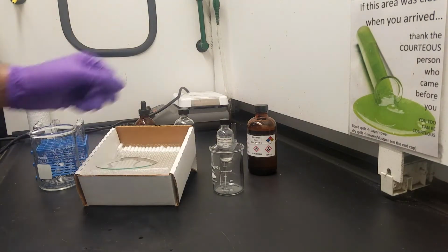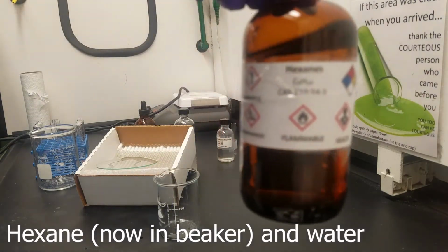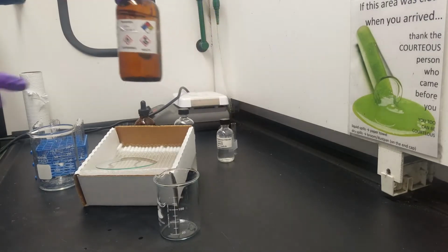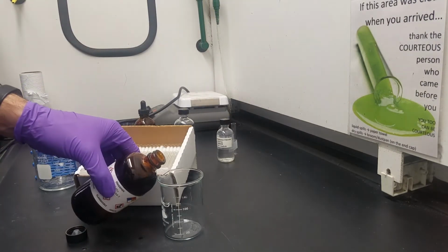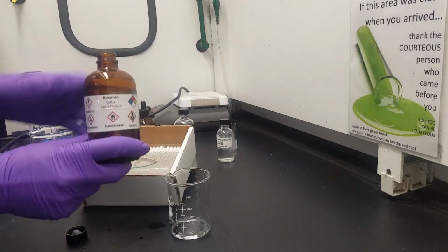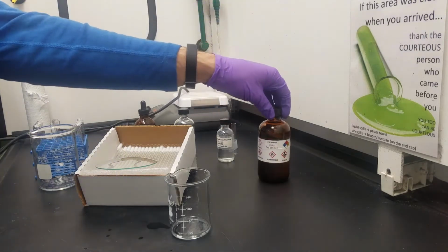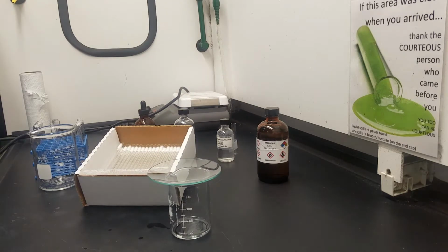And here we start yet another way that we could dispense of liquids. In this case, what we're going to do is pour out hexanes into a beaker because we're going to use a significant amount of it. So what we'll do is pour out roughly how much we need. We don't have to get super precise, but we don't want to waste a bunch either. So we'll pour in how much we want, cap our container, and then we can cover it to make sure we reduce evaporation. This way we don't have to worry about constantly going in and out of the stock bottle.